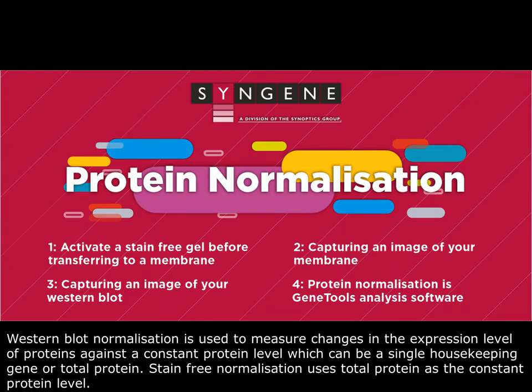Western blot normalisation is used to measure changes in the expression level of proteins against a constant protein level, which can be a single housekeeping gene or total protein. Stain-free normalisation uses total protein as a constant protein level.